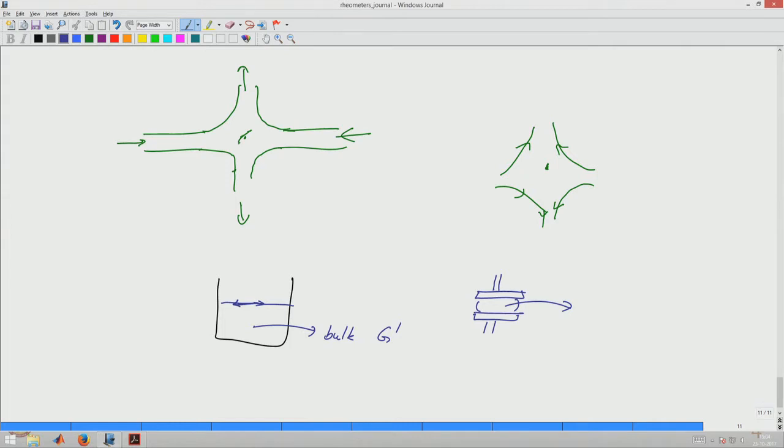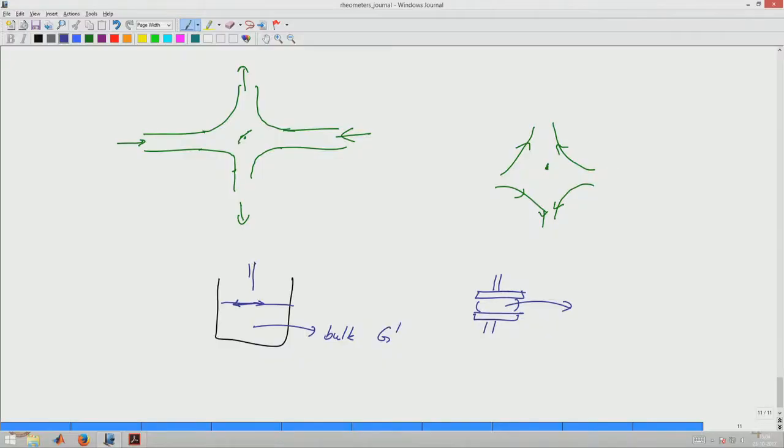So, what I need to do is let us say get the geometry, in this case what I can do is I can get the geometry and do the measurement only at the interface and see whether I get different torque. If I lower this, I may get more bulk properties, but at the interface if I do, will I get a property which is slightly different. And again in this case we will have to go back and forth to again see whether we are getting reasonable measurements, because these are all going to be very sensitive measurements.